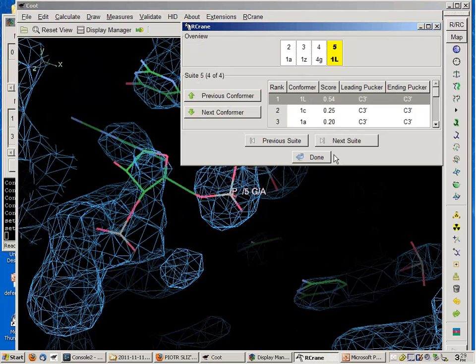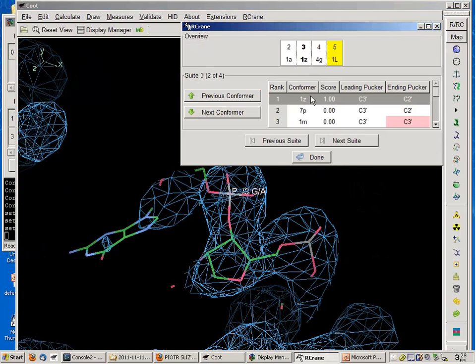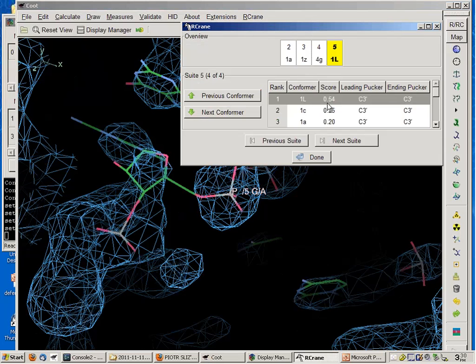It just basically tells you whether or not there was a close second guess. If we jump back over to here, you see that the top score is 1, the second score is 0, so there's really no reason to try any alternate conformers here. Whereas here you might want to try things because it's close to a factor of 2 difference. Here again, I mentioned 1A was the helical conformer, so you might also want to take a look at the 1A conformer here. Just since that's helical, that's sort of a special case. Depending on how you measure it, about 70% of your structure should be 1A. So if there's something right in the middle of the helix and everything looks fairly helical, even when 1A is your second or third choice, it's worth at least taking a look and seeing how that fits the data.